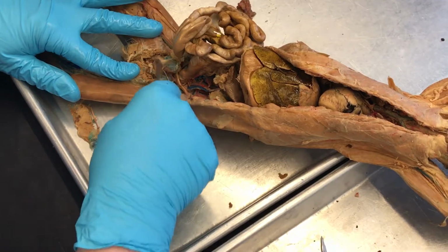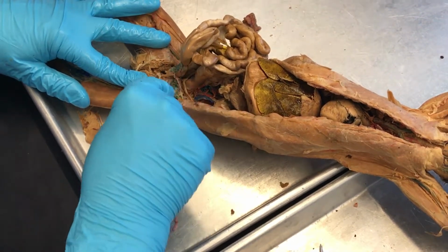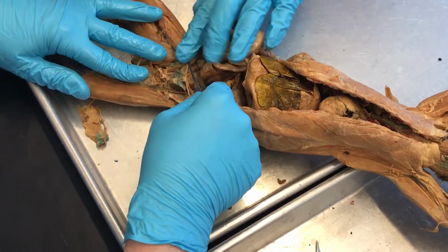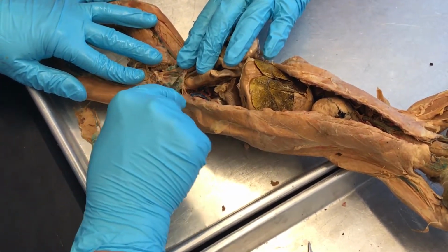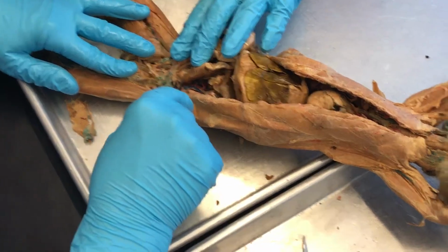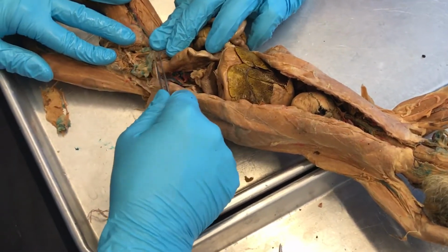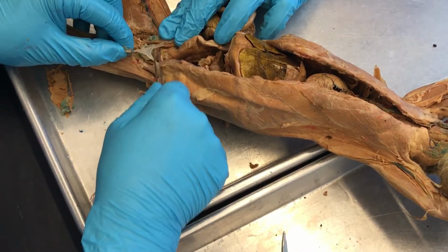Urethra. And let's see if we can pull that bladder out of the way a little bit so we can follow the next tube underneath. I'm even going to take out this fat. It's just not helpful.